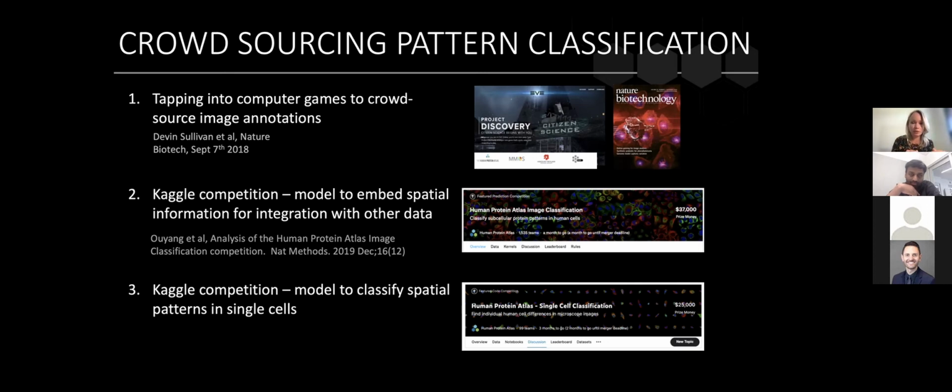The bottom one there is the recent Kaggle competition that closed earlier this year. It was a competition to provide labels for every single cell in an image, but given only weak, noisy input for the training data. And both challenges have been super successful. It's a very fun way. You have to work hard to set up the competition and think about how to do it so that the outcome is good. But in the end, it's a very good way of sourcing many models in a short time. So today I will briefly show results from both.